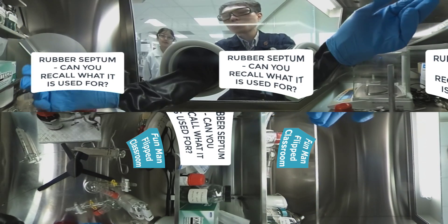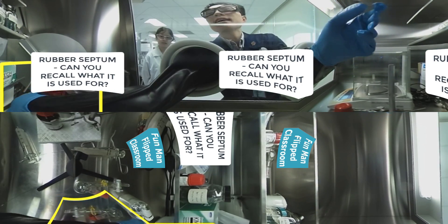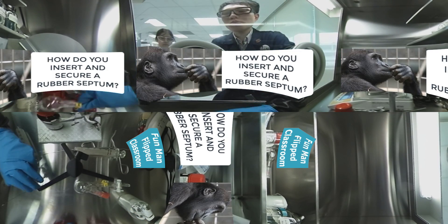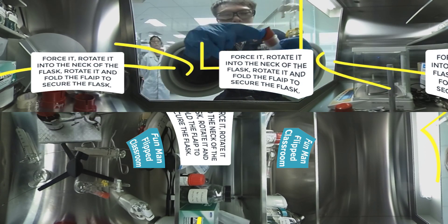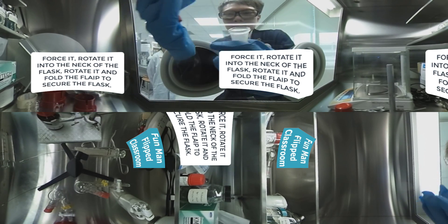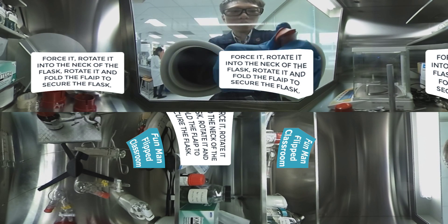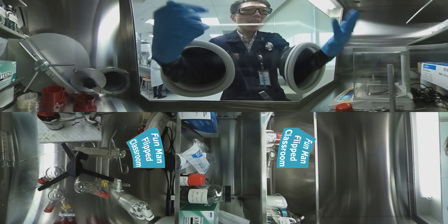Now I'm reaching out for a rubber septum, and here we have a setup ready. I'll show you how to insert and secure a rubber septum. You force it, rotate it into the neck of the round bottom flask, and rotate. Then move the flap and fold it nicely to secure it. There you go.